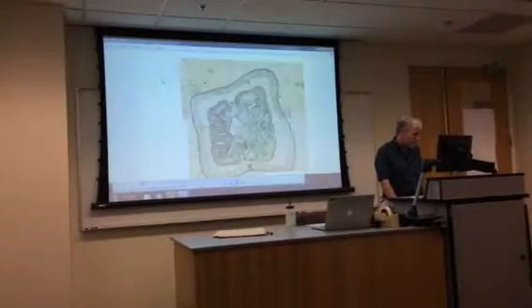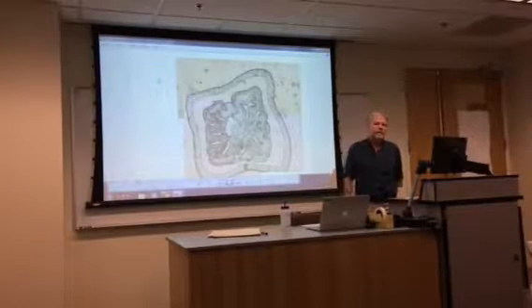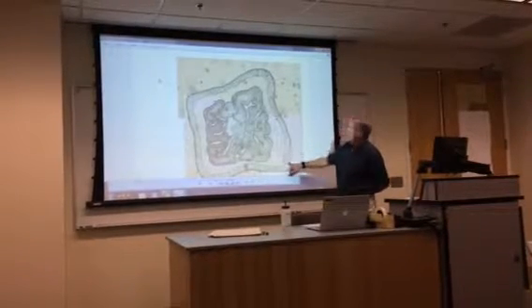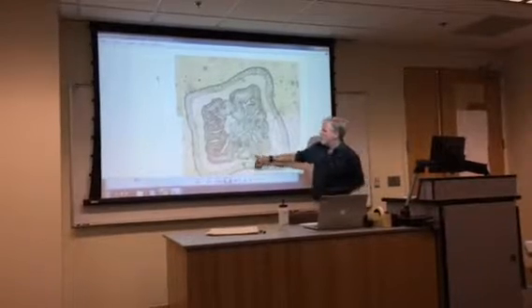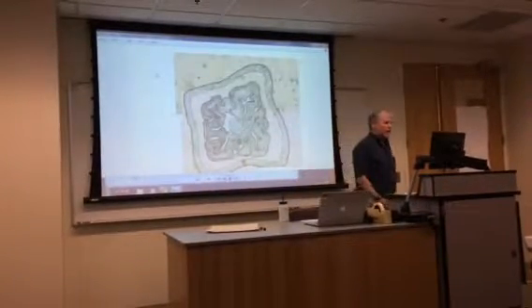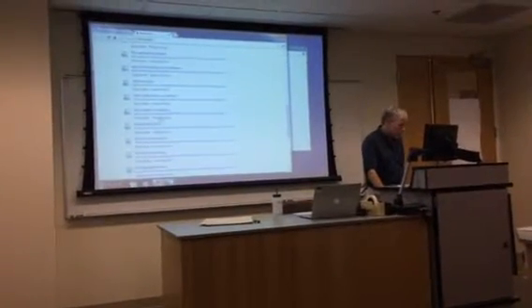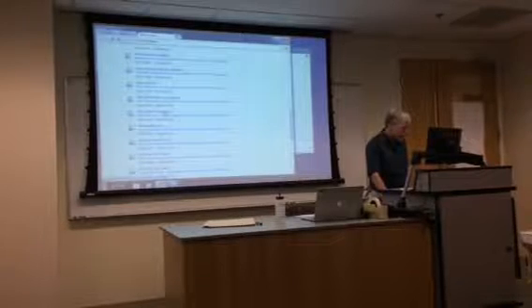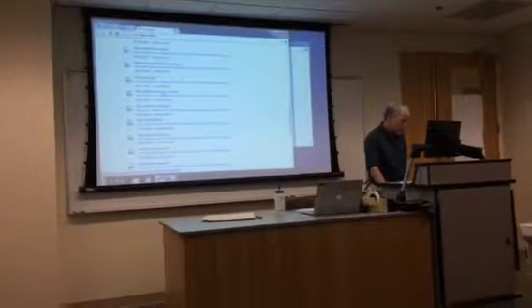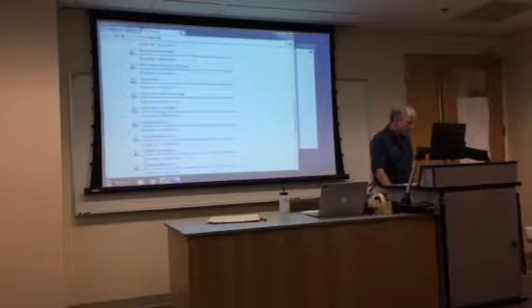All right, so this one I don't like. I mean, if you looked at this one, it's kind of like not much going on. You just see the capsule wall, and then you see spore tissues that haven't developed yet, and this is the columella. So I wouldn't sweat this one too much. That one's not very good either. I like that one.